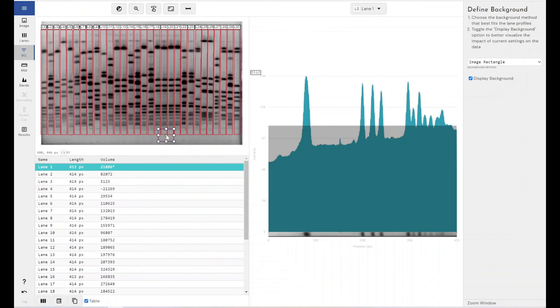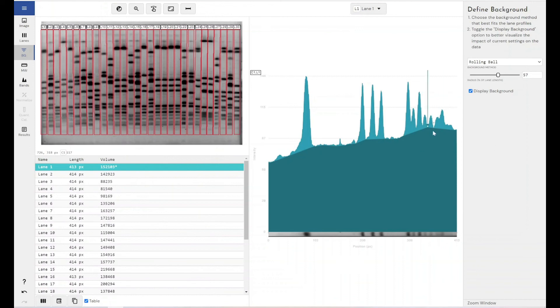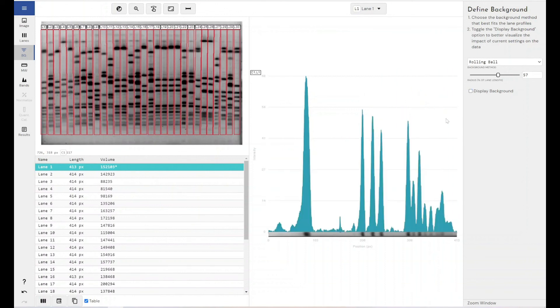So the question of what is the best background removal method to use, it's subjective. We would say in most instances, a good rolling ball setting is what you would need and would be preferable. However, you do get the option to play with all of the different background removal techniques and see what that is going to do to your data, what your lane profile is going to look like, what your bands are going to look like if you do go ahead with those settings.